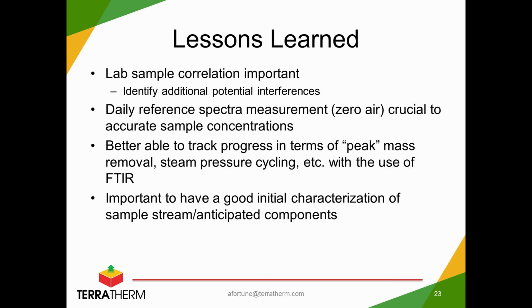So like I said, the lessons learned: the lab sample correlation was very important. It allowed us to identify these additional potential interferences, as well as make sure that if we had these kind of false positives with the vinyl chloride, that we really didn't have vinyl chloride there.